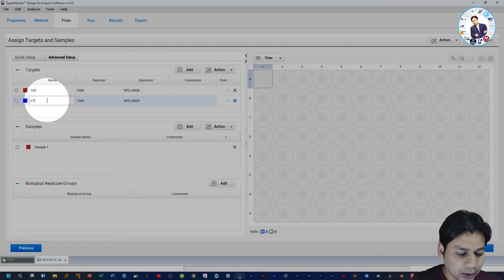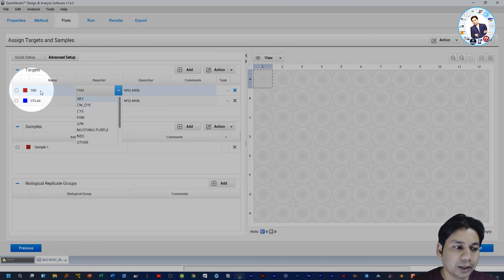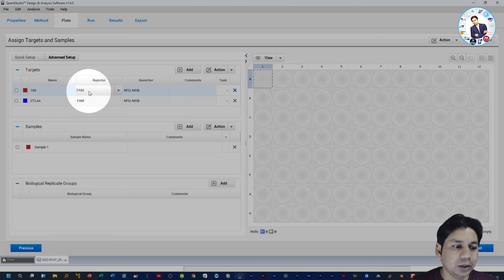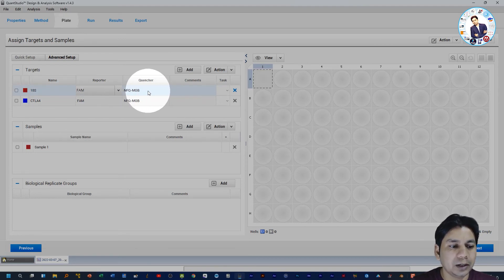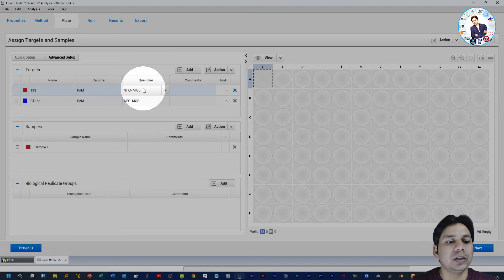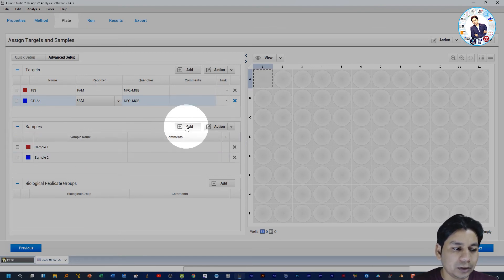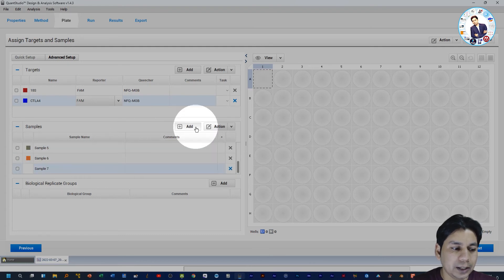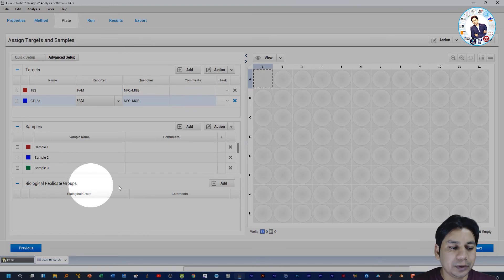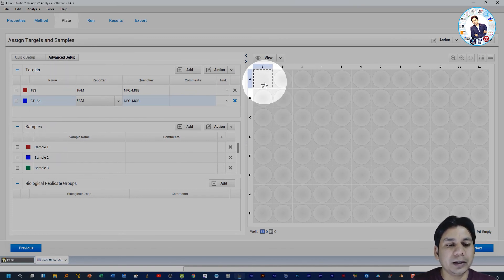You can rename the targets. I am setting 18S as the endogenous control and CTLA4 as the gene of interest. If you want to change the reporter dye, click on it and select accordingly. I am using FAM reporter dye for 18S. Similarly, you can select the quencher according to your reaction mixture for both 18S and CTLA4. In the Sample section, click Add to add new samples — I am adding 8 samples. If you are using biological duplicates, you can select that group option here.